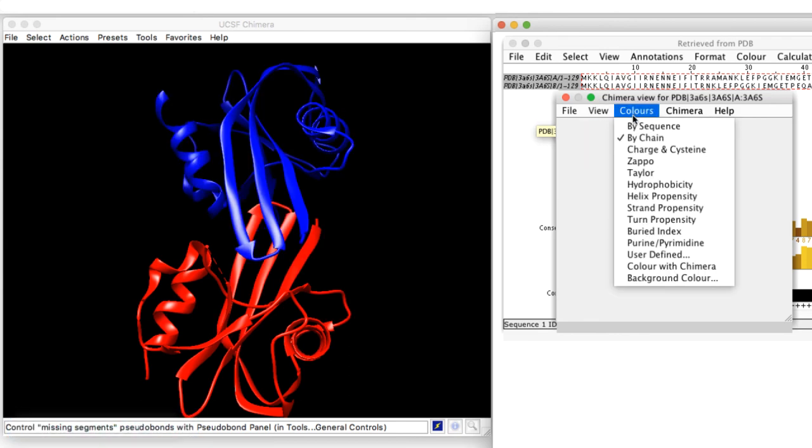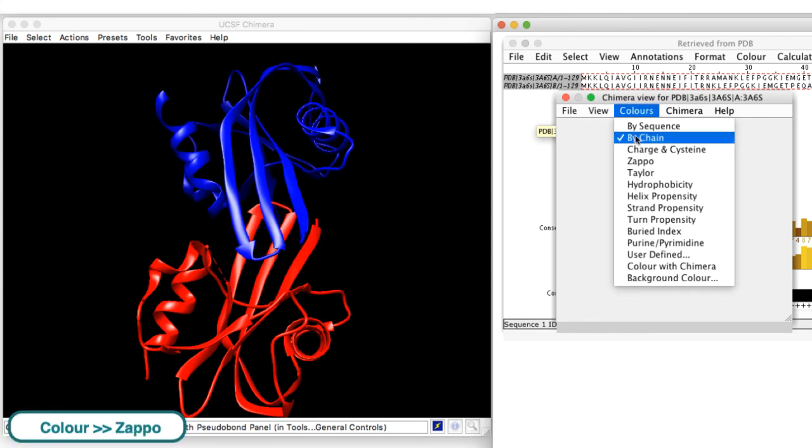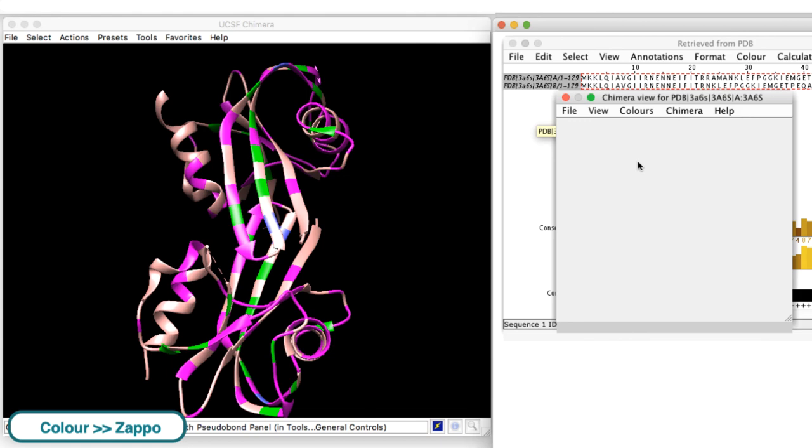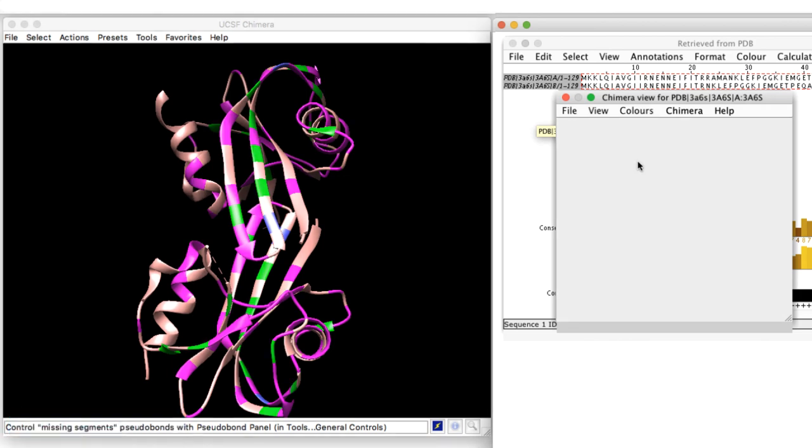There are a range of different colouring options available. In this case, I have coloured the structure based on the physicochemical properties of the residues.